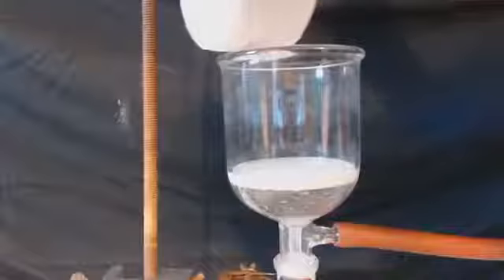So that's what I got. It's a dirty colored water. After a day, this solidified. I had it on a heating source, and it got too hard. I mean, it was hard as heck. So I put some more water in it, and this is like a day after that. It's somewhat hard, but I can break it apart, so I'm going to filter it.